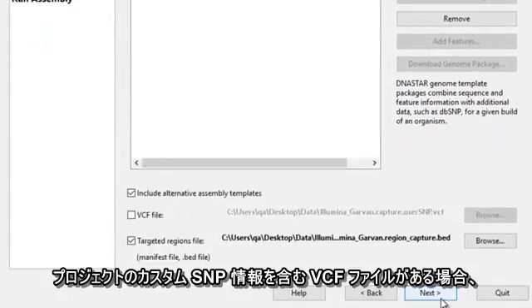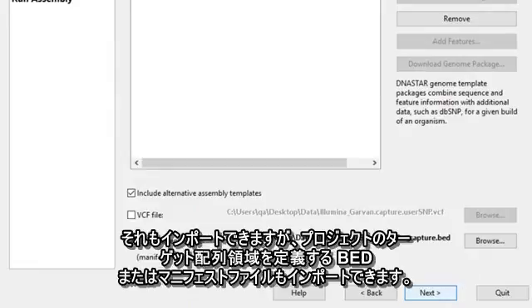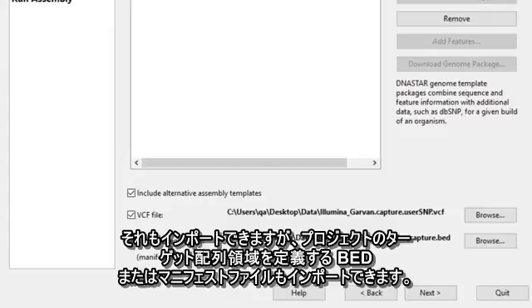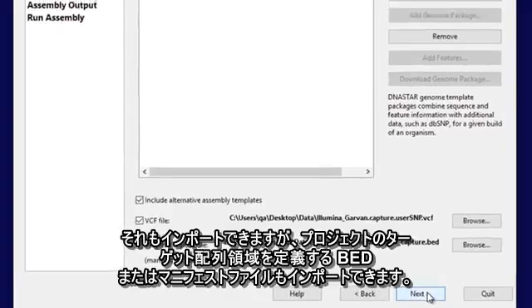If you have a VCF file with custom SNP information for your project, you can import that too, as well as any bed or manifest files that define the targeted sequencing regions in your project.